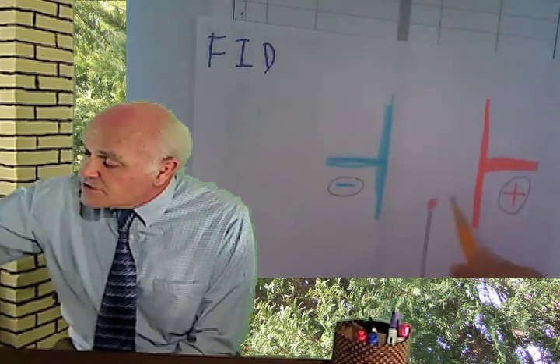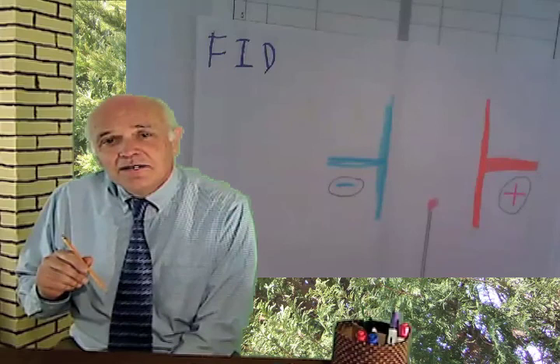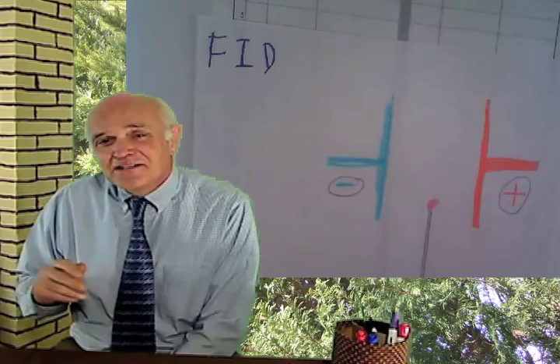If you see a gas chromatograph and you see a little mirror next to it, or like a stainless steel spoon, you know it's an FID, because the operator determines whether the flame is lit or not by putting a little mirror over it and looking for the vapors. Kind of one of the little inside things about the FID.